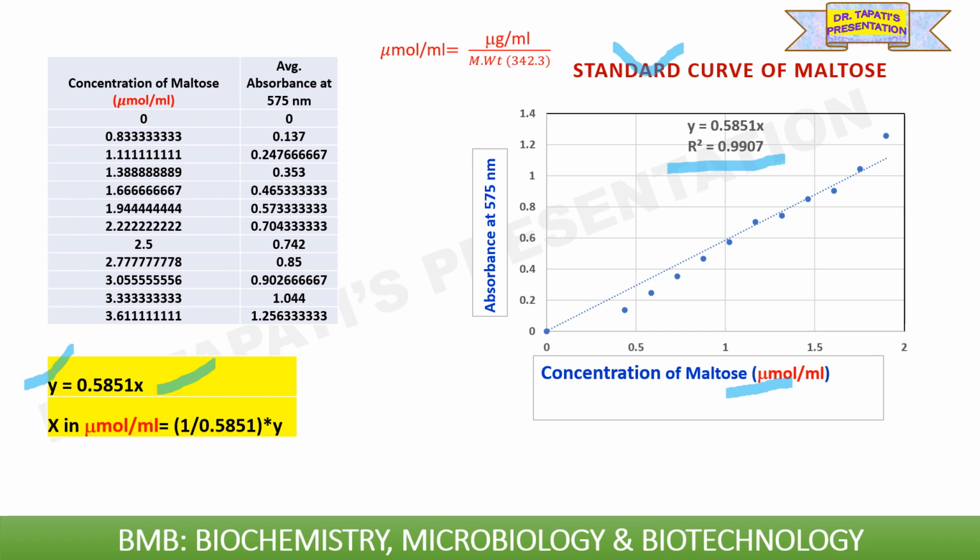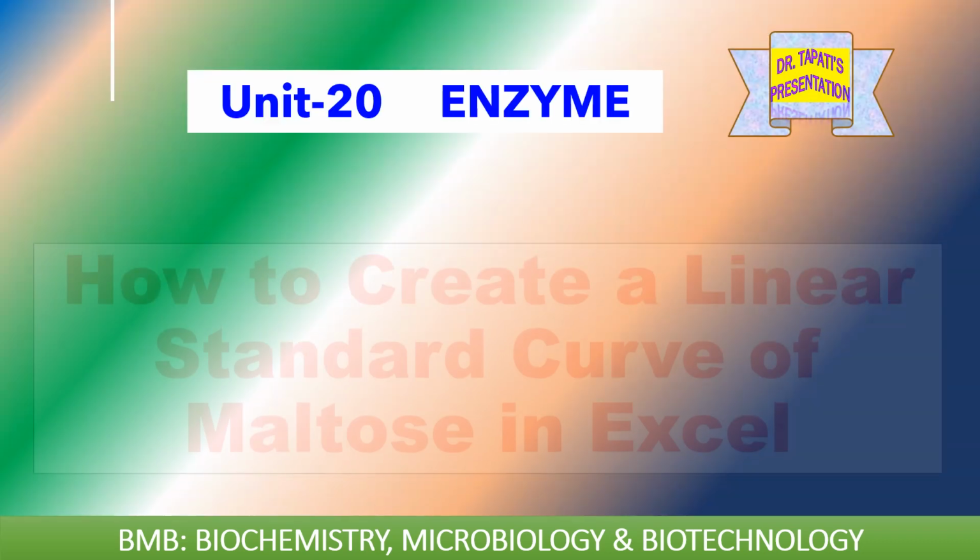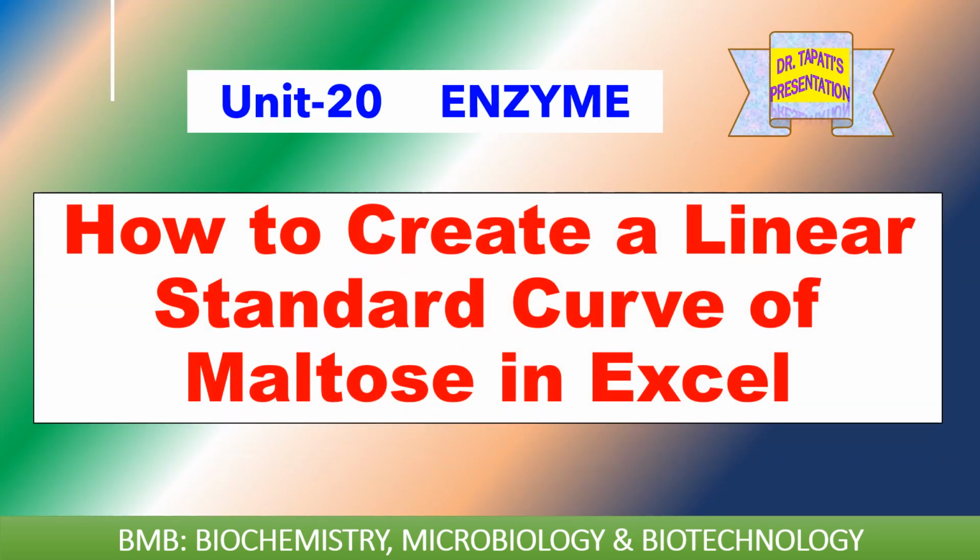Today in this video, I will show you how I made these two standard curves in Excel sheet. So today the topic of the presentation is how to create a linear standard curve of maltose in Excel. Kindly stay with me till the end of this video and follow all the steps that I am going to show you in order to make a linear standard curve of maltose in Excel sheet.